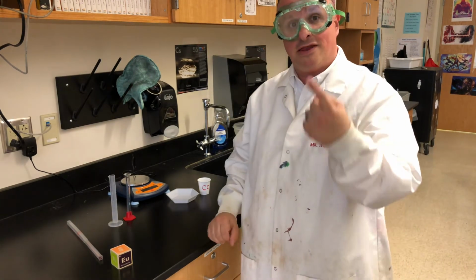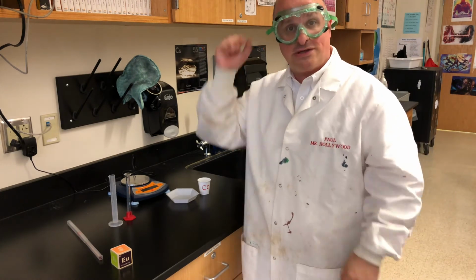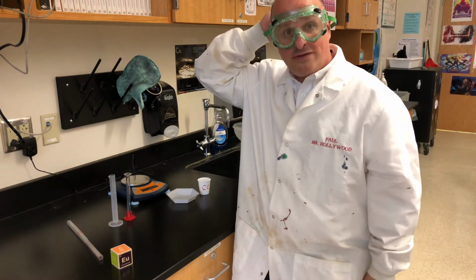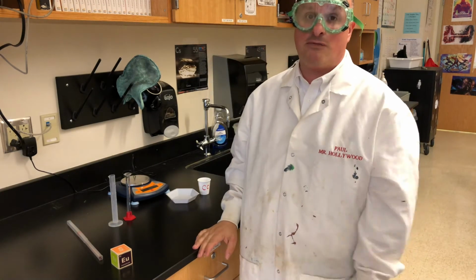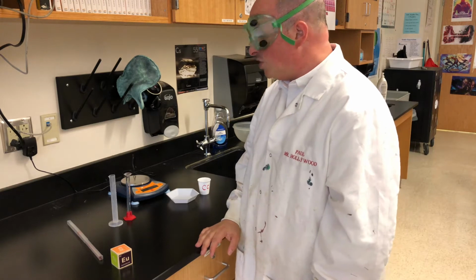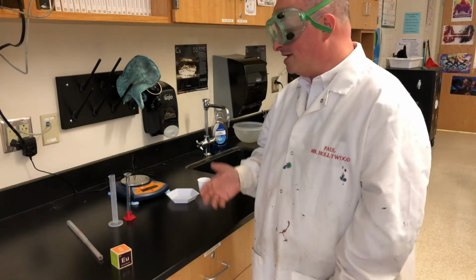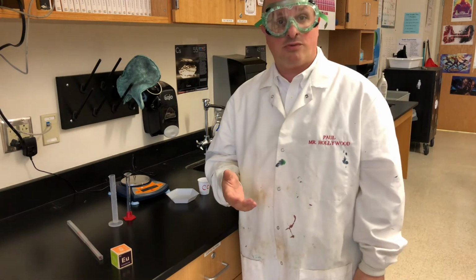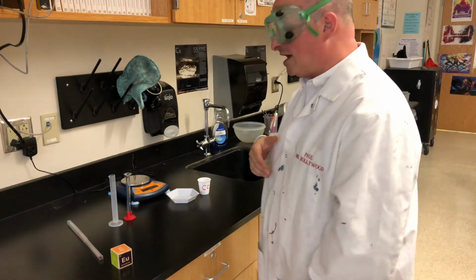Now keep in mind that if you take off your goggles during the lab, you're going to be kicked out of the lab and you'll lose points in classcraft. Because the whole point of these goggles is to keep your eyes safe. They can't do that when they're not covering up your eyes. So, what are the safety restrictions that we have to worry about? Well, as I mentioned, one of the chemicals we're working with today does sometimes cause irritation, so we're going to make sure we wear this the entire time.